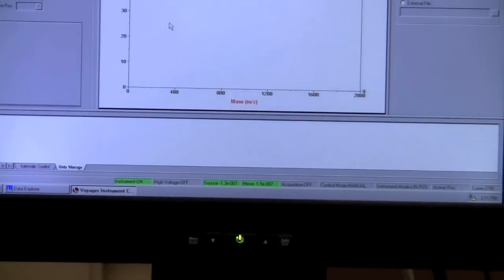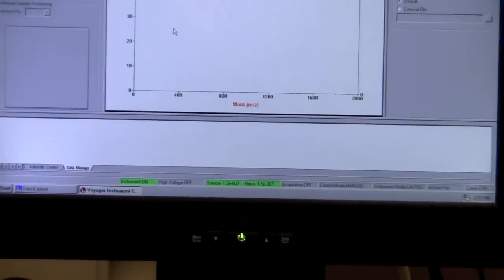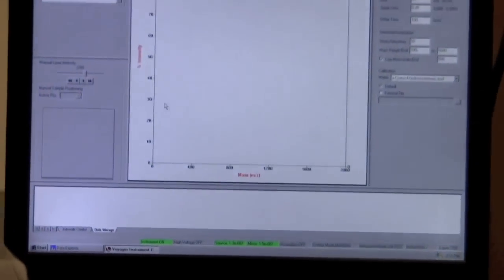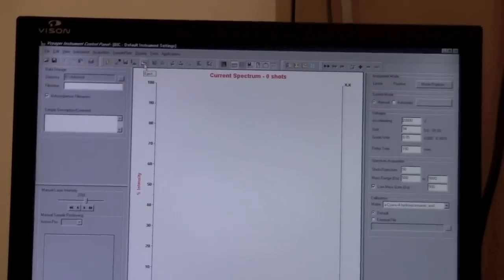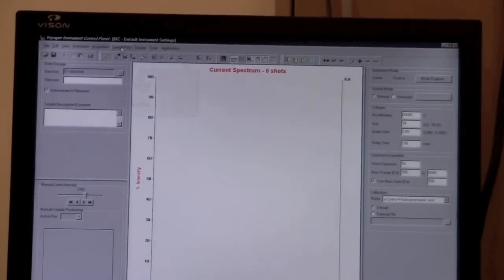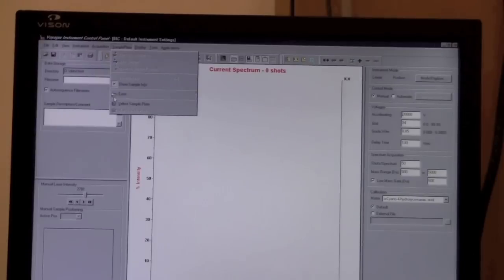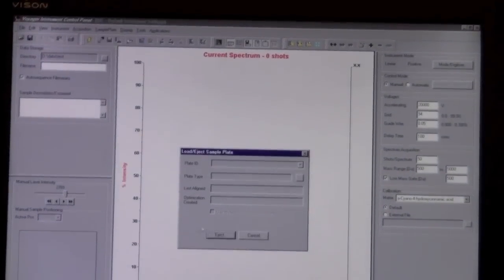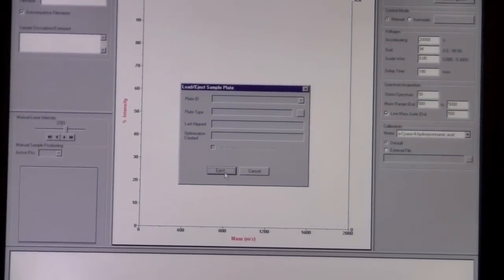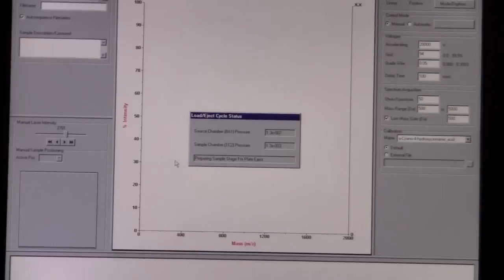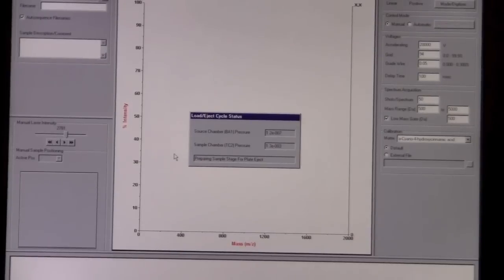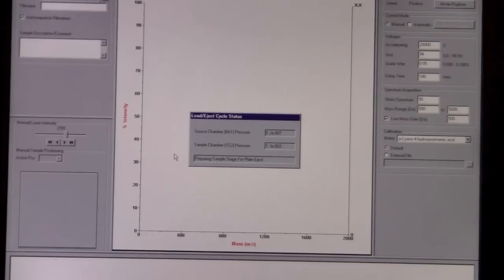So the first thing we want to do is load our sample plate. We will either click on this hand icon or go to sample plate and select eject, and then we're going to press the button that says eject. Now this process takes a little while, so we will come back after the process is completed and the sample plate holder has ejected.